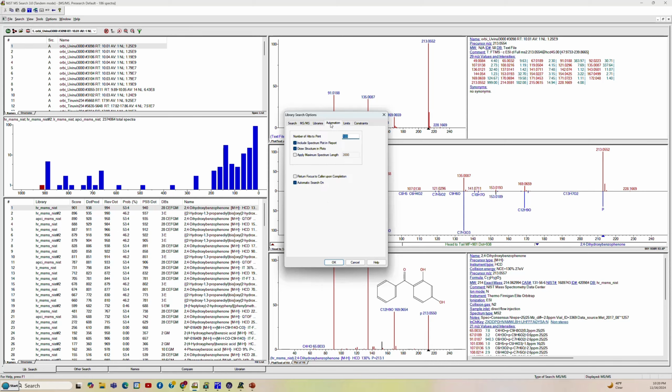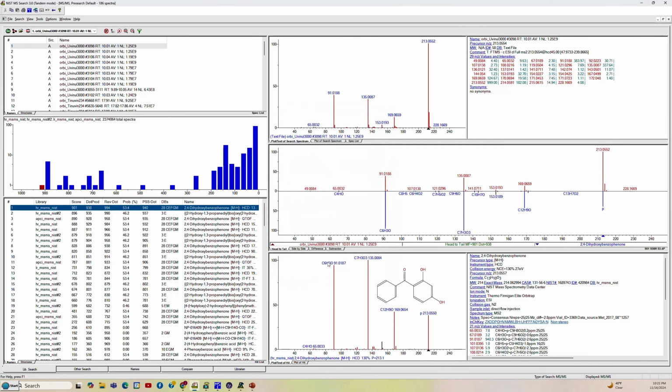So that looks good. The automation looks good. The limits, everything looks good here. There's nothing else to change. So that looks like everything's set up properly there. So we'll say OK. The one other thing is you might need to set up the libraries for structure search too, because the libraries for structural searches where you search by structure can be specified different than the ones that you search by spectrum. But I usually keep them both set the same. Say OK. So that looks good.